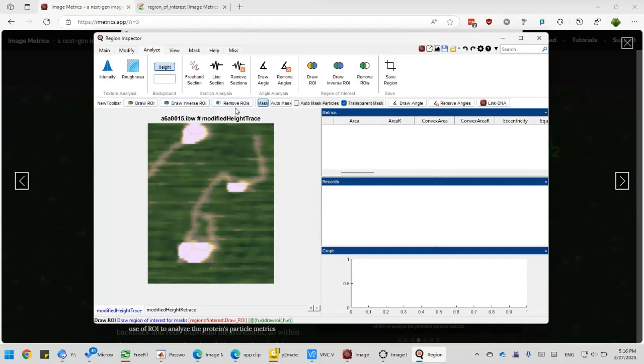Now you can do that yourself. You simply right-click a tool, and then click Add to Toolbar. You can create a new toolbar as well if you want to do that. Just say Create New Toolbar.